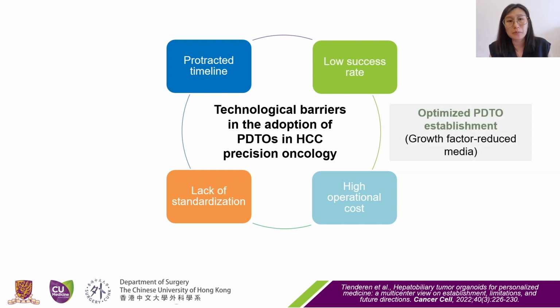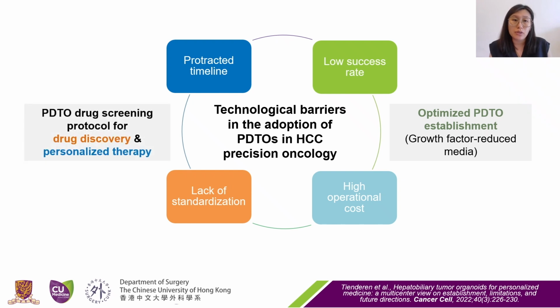To tackle these problems, we optimized the organoid establishment method primarily using growth factor reduced media, and further developed a drug screening protocol amenable to drug discovery and personalized therapy.